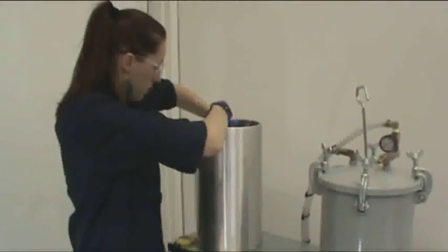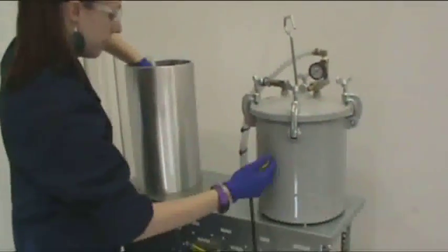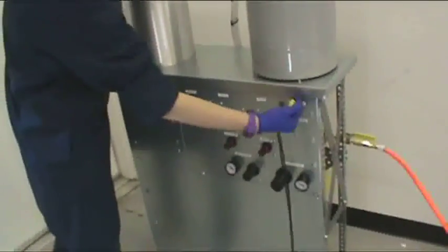In addition, attachments are connected to the filter in order to seal them and perform a true back flush by using solvent and compressed air. The attachments are also capable of performing a more unison wash of the filter and achieve a better representation of debris caught within the media for analysis.